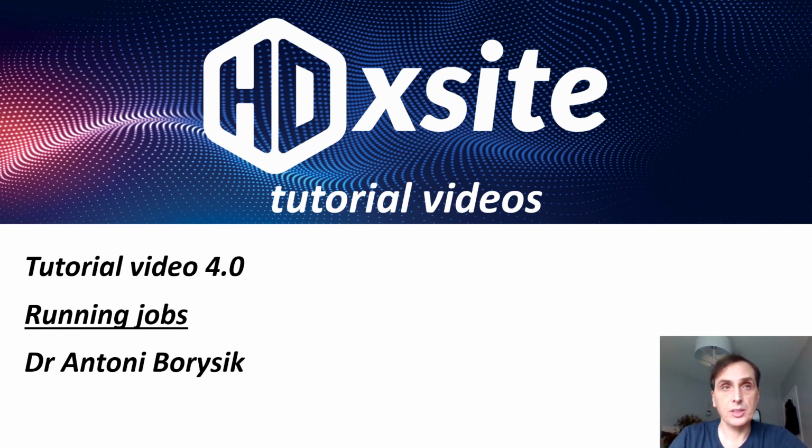Hello and welcome to video number 4 in this series of tutorial videos for HDXmodeller, and in this video we're going to look into more detail about how to run jobs.